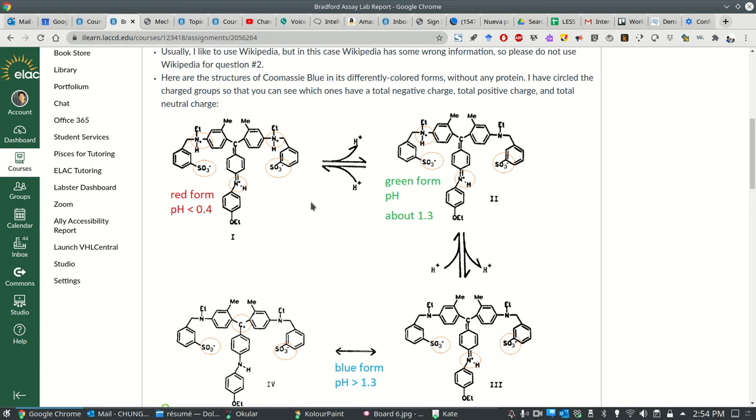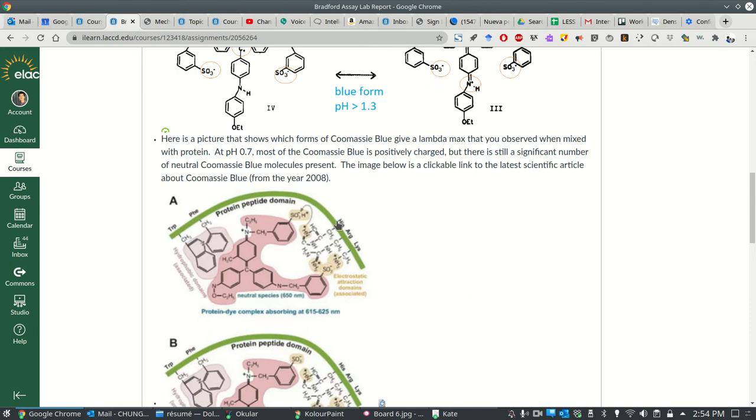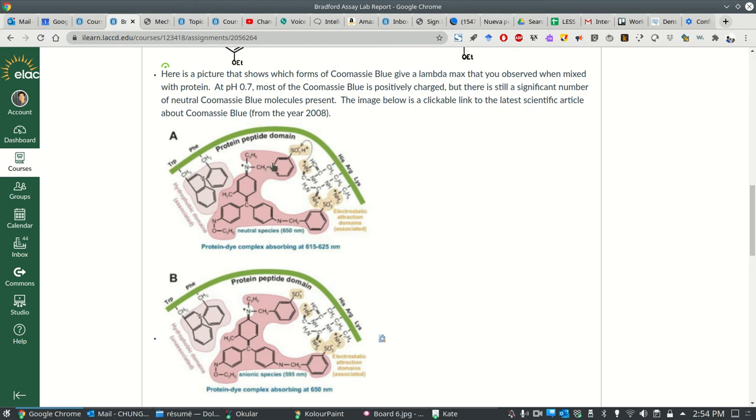All right. So why do we have a pH at 0.7? We have a pH at 0.7 because we want the following to happen. We want this guy to form a complex, meaning to have intermolecular attractions with the protein in this area and in this area. So this is not a charge-charge interaction. This is just polarity, possibly hydrogen bonding there, right? And I think you can recognize what's happening here yourself. Actually, it says right there what's happening there.